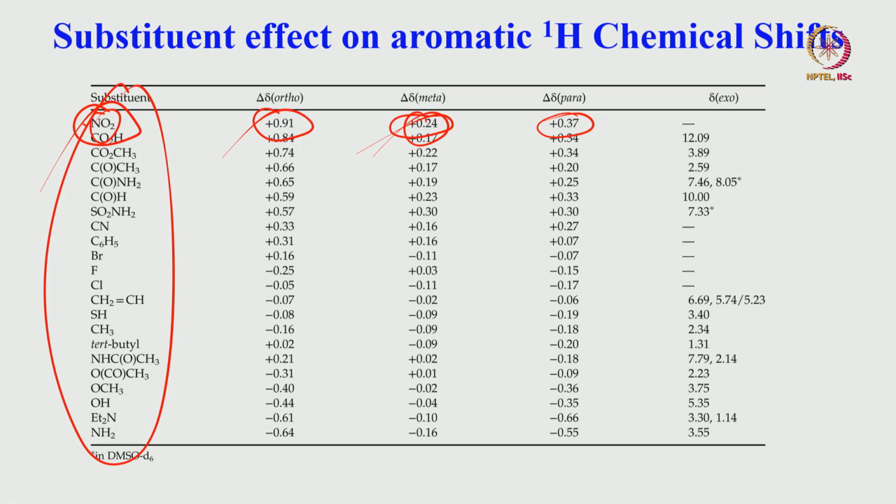Not only addition, it can also subtract with negative signs. So for different functional groups, this has been worked out. By and large, it gives you precise values. I mean, of course, nothing can beat the experiment. You cannot say it is an experimental value, but by and large it comes close to the experimental value. Using these values of the substituent, and the values given in the table, we can predict the chemical shift of all the protons.